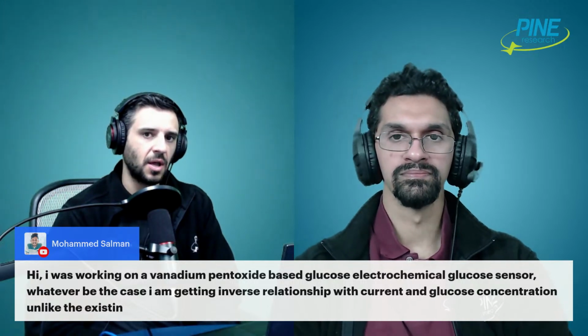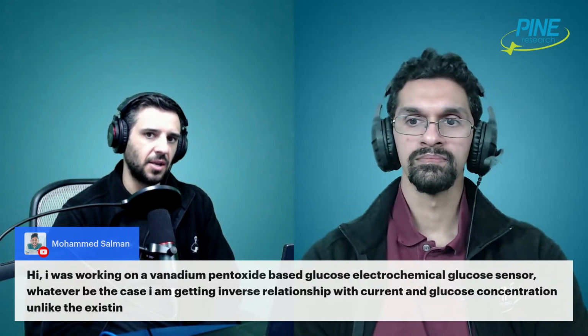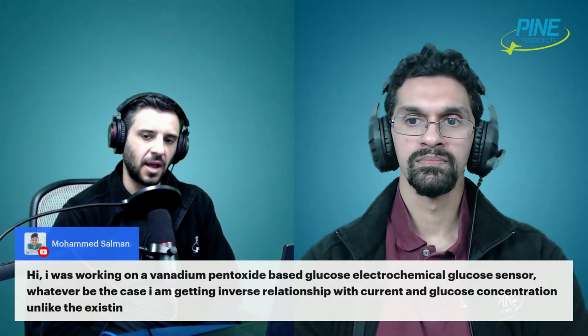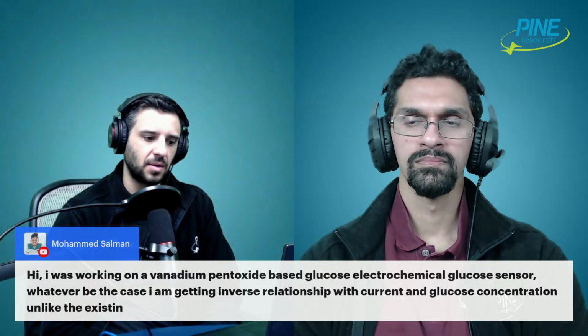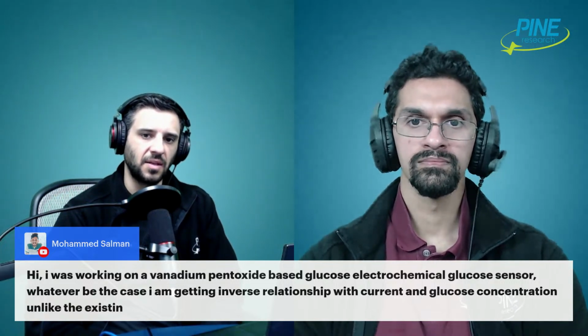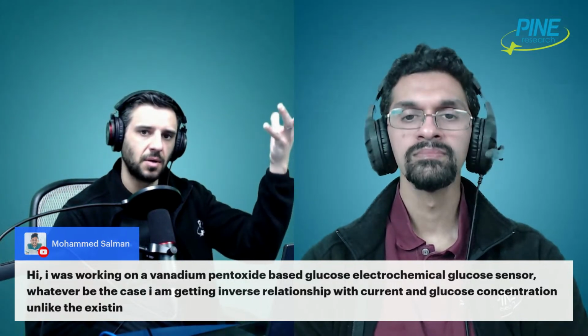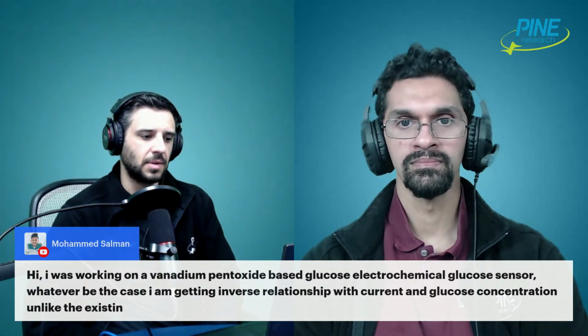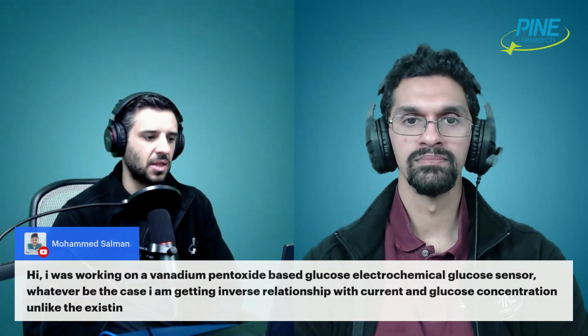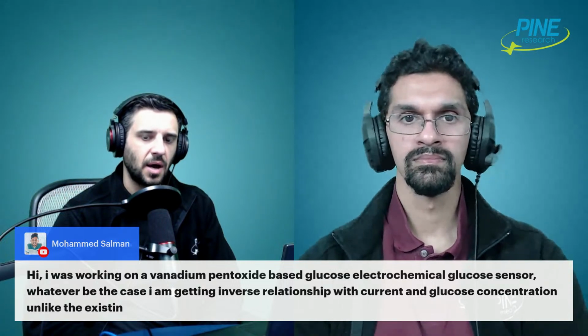But if you have a lot of IR drop in your system and you're trying to get a clean set of calibration curves or something, you might be fighting against internal things in your system that are reducing the ability to measure the current of interest. Those are some of the things that can really impact these types of measurements.